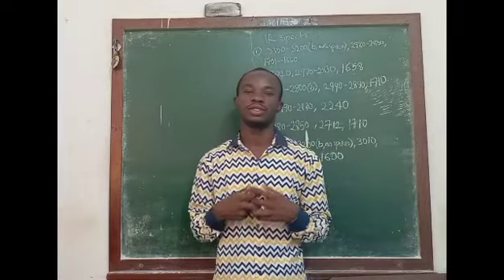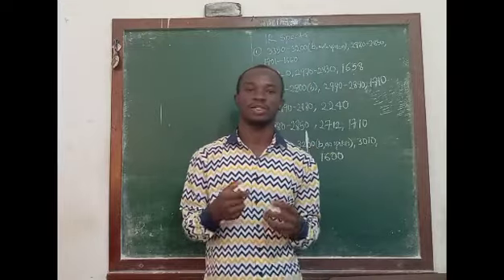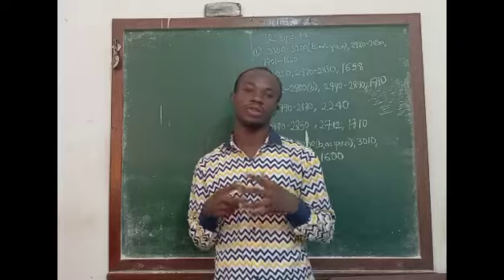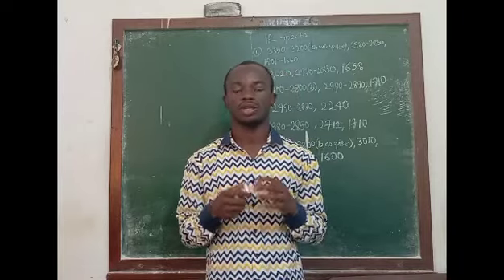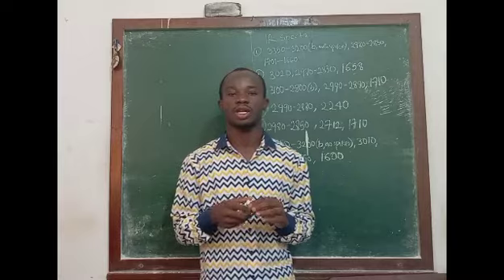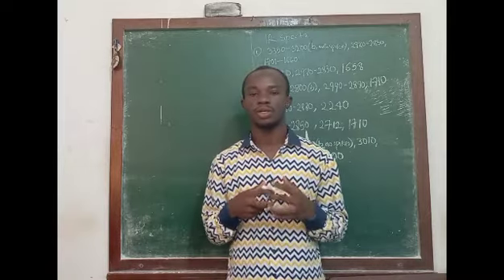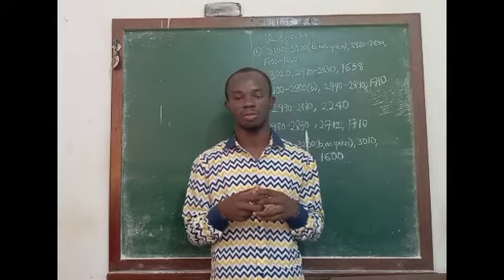This section will be the third video on how to read IR spectrum. At the same time, this video will also be the last video, or let me say lesson, on how to read IR spectrum. In the previous video, we were able to look at how to read IR spectrum in order to identify whether the spectrum contains a saturated compound or an unsaturated compound.